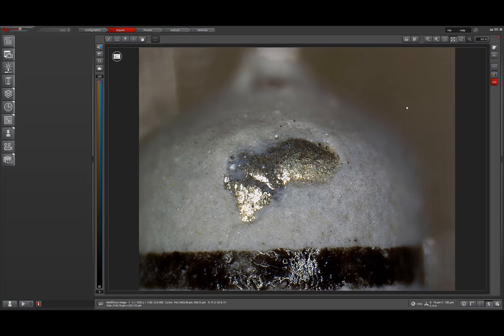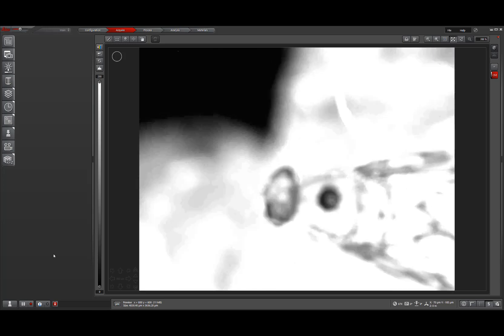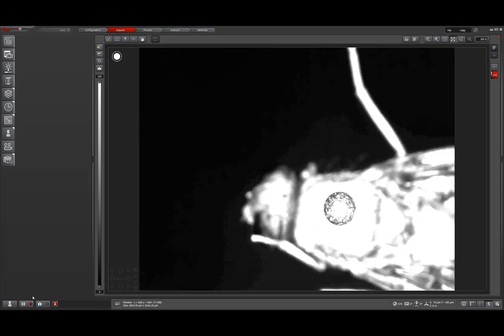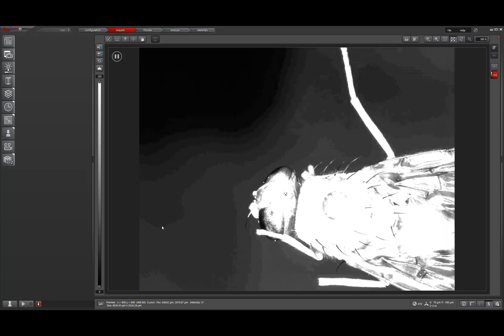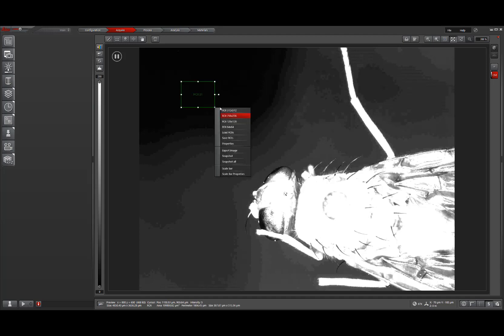From there, I'm going to go to a live image and show you the changes to our region of interest tool. So just like before in LASX version 3, we can simply right click and drag a box on the screen to drag a region of interest. We can also use predefined regions of interest and we can save customizable sized regions of interest through our save ROIs and load ROIs tool.